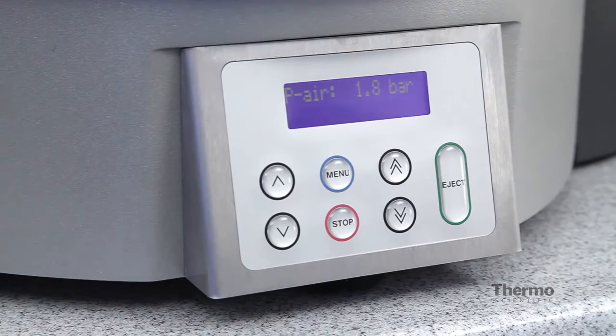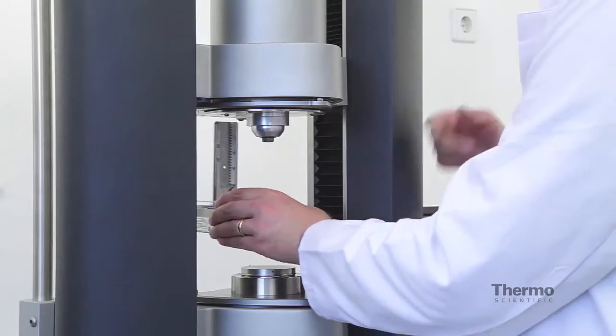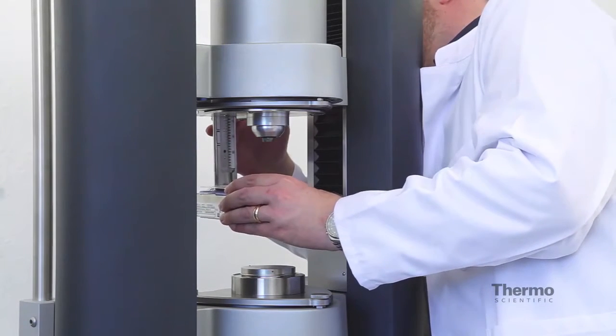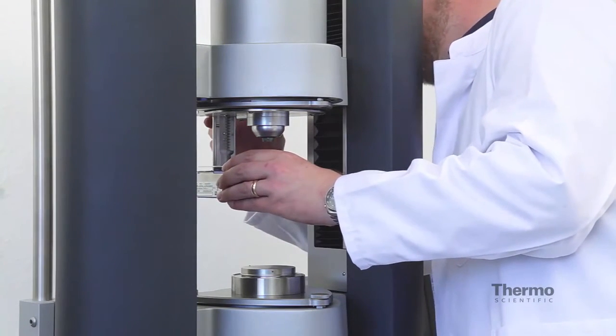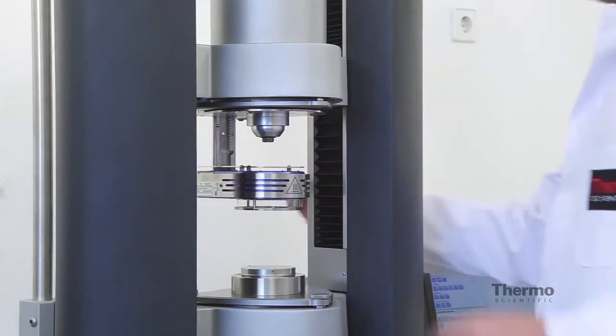The display unit now also displays the air bearing pressure to prevent any failures. As shown before, for the lower temperature option, an upper electrical heating system can also be attached to the MARS within seconds.